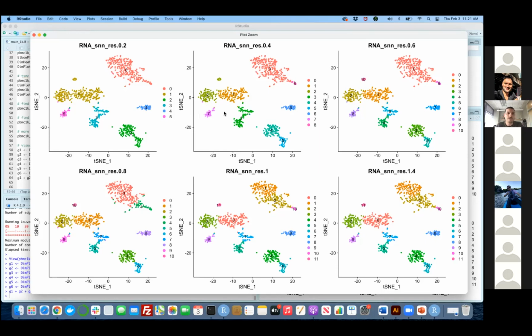Thank you. It sounds quite simple, eh? To answer Simona's question, there is no right or wrong answer here. You're just discovering. If it was just one linear workflow, you wouldn't be doing your job. Sometimes, as we'll see, clusters 1, 2, 8, 6, and 4 are actually T cells that we're going to pick apart as CD4s and CD8s.